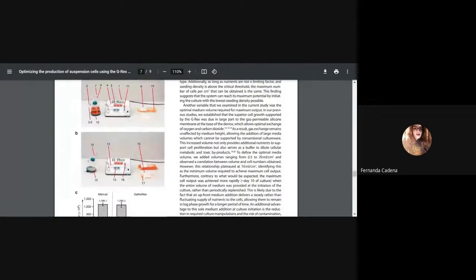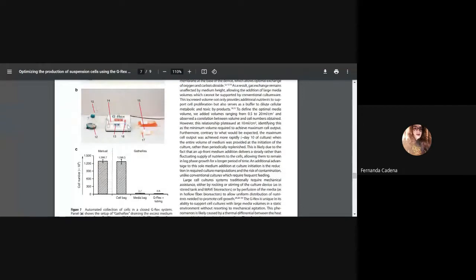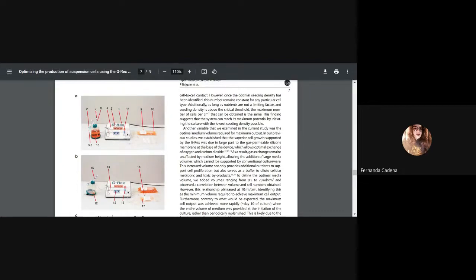And the last thing here, we can see how this machine is working. We can see that they have a lot of components connected. Number one is the pump. Number two is the 0.2 micrometer sterile filter. Number three is the medium collection button. Number four is the medium line clamp. 5 and 6 are medium supplement input ports. 7 is the medium sampling port. 8 is the medium collection port. In 9, we have the medium bag. 10, the medium. And 11 is the medium line optical detector.